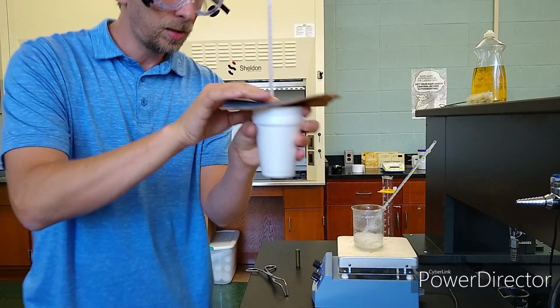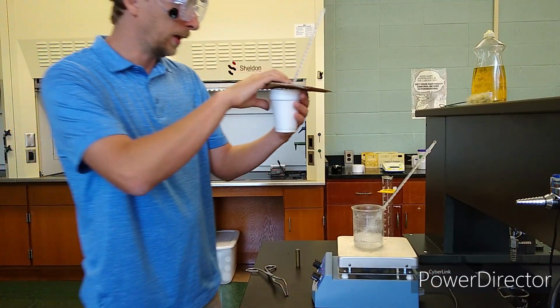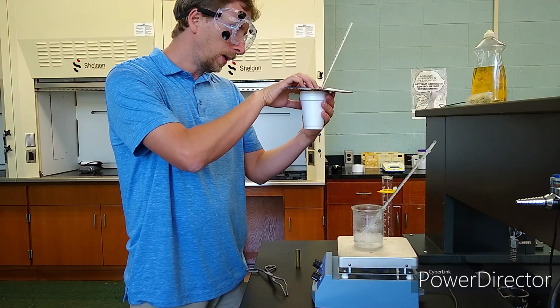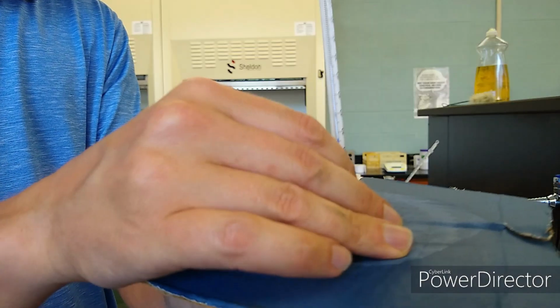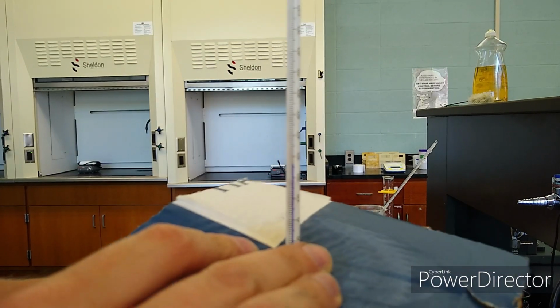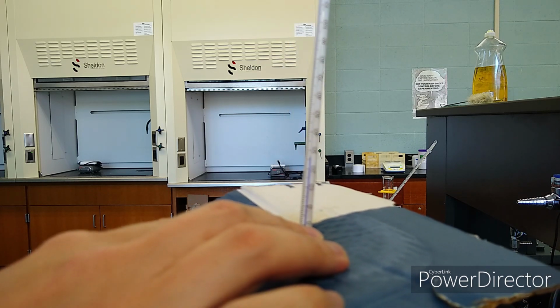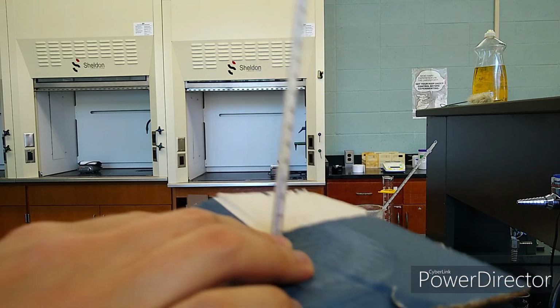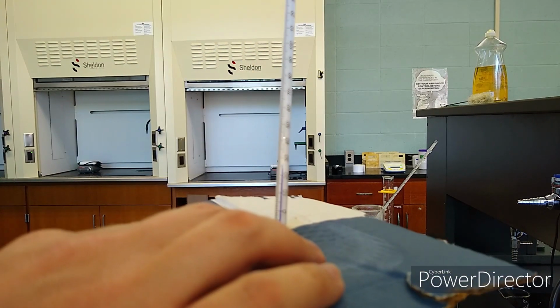I can maybe see that. It's probably lost some heat to the surroundings because we don't have a very good lid, and I'm swirling it a lot. Now it's up to 27 degrees Celsius, 27.0. See that, 27.0. You see that good? Man, that's hard to see, huh? I'm sorry. Yeah, can't get focused. I'm just going to have to take my word on it because I can't get focused on it.